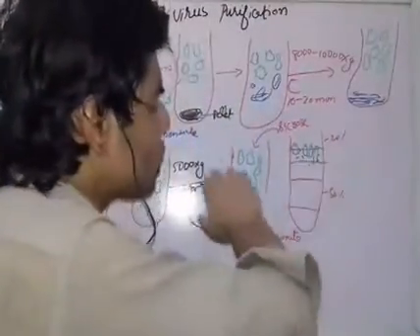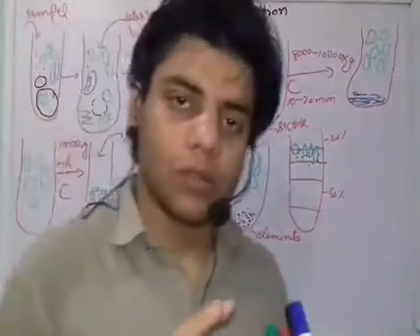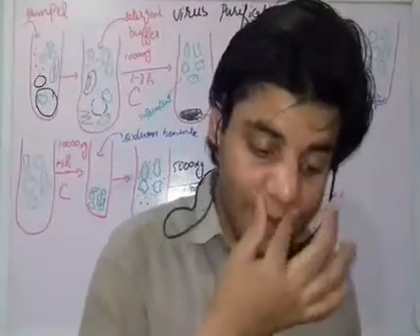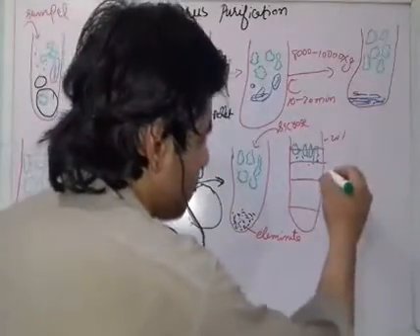By loading sucrose, we get the 3 layers, and in the upper layer there will be our solution, meaning incomplete or complete viruses are present. After that, we again centrifugate this.